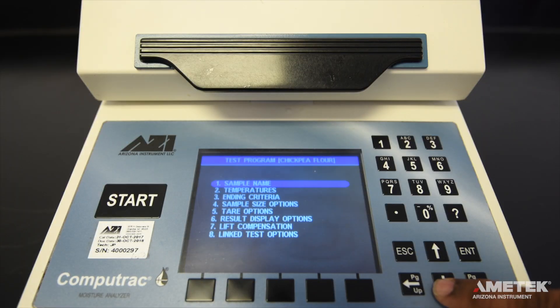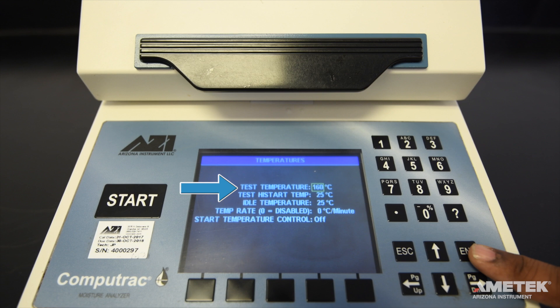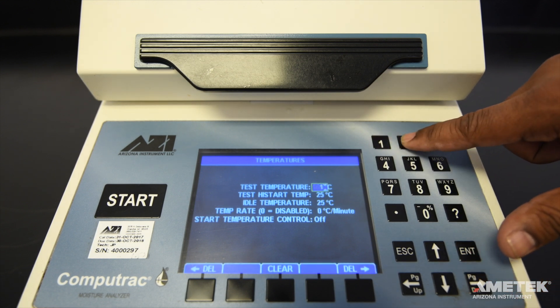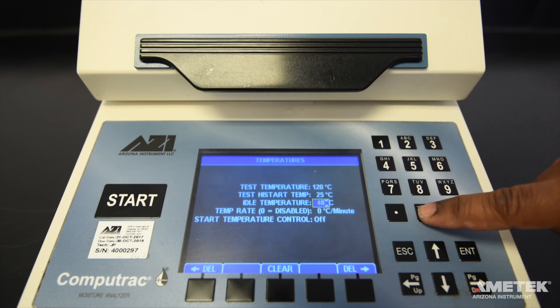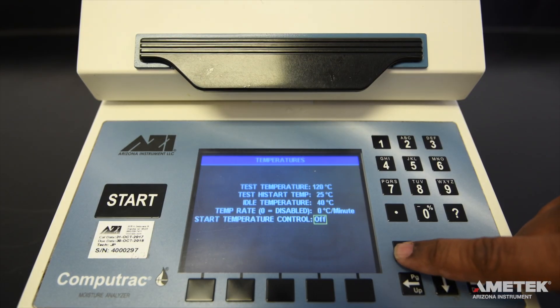The next parameter is temperatures. Select temperatures and press enter to begin editing the temperature settings of your new test program. The most common fields that you may need to edit are test temperature, high start test temperature, and idle temperature. Use the arrow keys to select the field or fields you wish to edit and the number keys to enter information. Press enter to save each field. Unless otherwise instructed, leave temp rate and start temperature control at 0 degrees and off. When you are done editing, press escape to return to the previous menu.